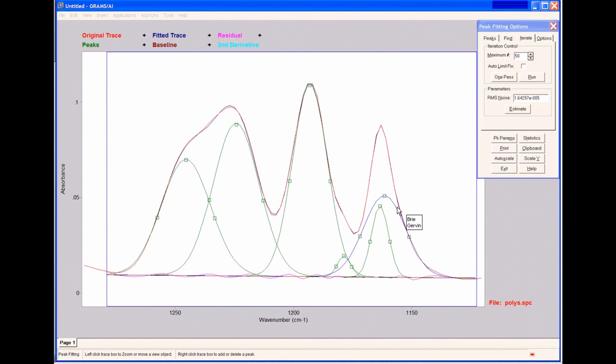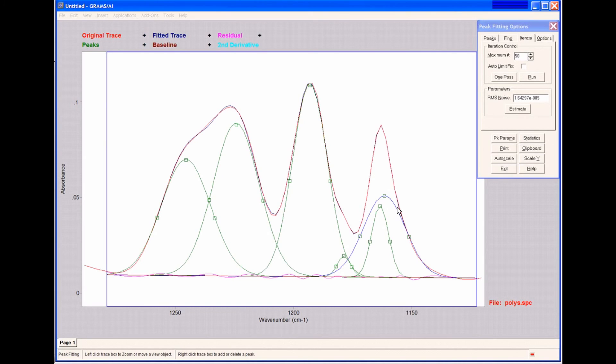Now, peak fitting, there's no one right answer when you fit data. There are many mathematical solutions, depending on how many peaks you choose. I could continually add peaks here and converge on different solutions each time. So it's up to the user to determine what's reasonable for their data and which peaks make sense.